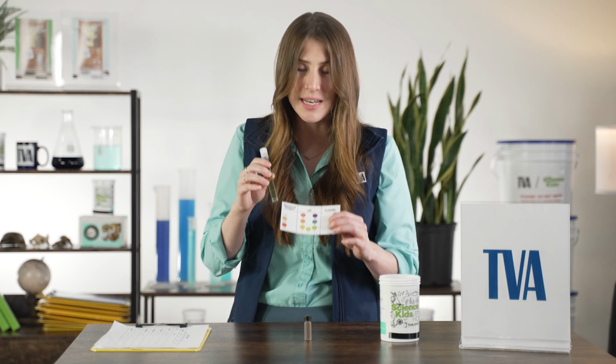We want the pH to be between 6.5 and up to 9 to be considered a healthy normal range for our aquatic life. Does your pH value fall within that range? And do you think it would support aquatic life in your water?